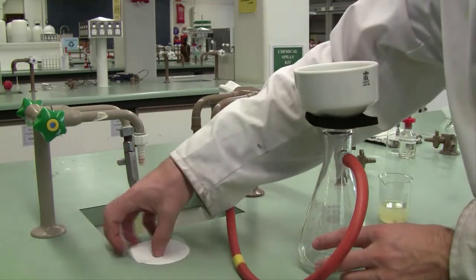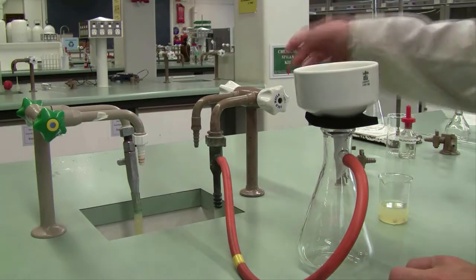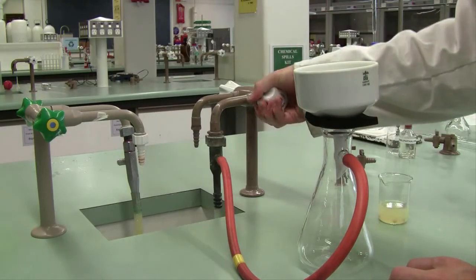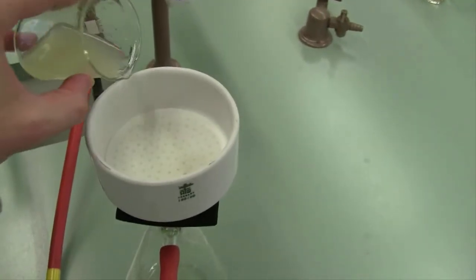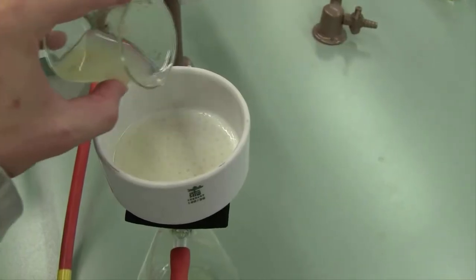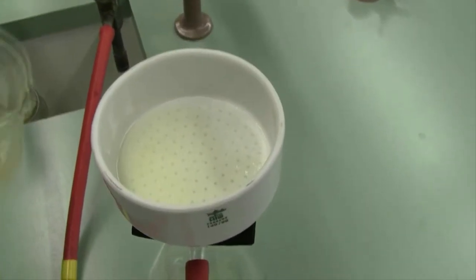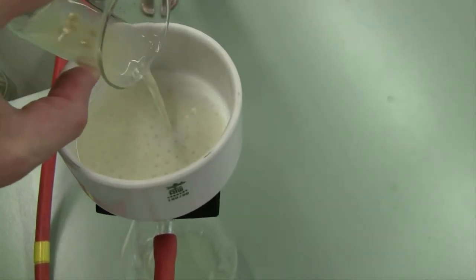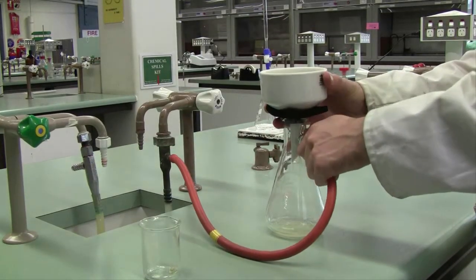Place a sheet of filter paper in the top of your funnel and turn the tap on. This will create a vacuum inside the vacuum flask. Pour a small amount of your lemon juice onto the filter paper — just a little bit of liquid — make sure you wet the filter paper first, as that will get the vacuum started. Then pour the rest of your lemon juice in and you'll end up with filtered lemon juice. Detach the side arm before you turn off the tap — it is most important you detach it before turning off the water.